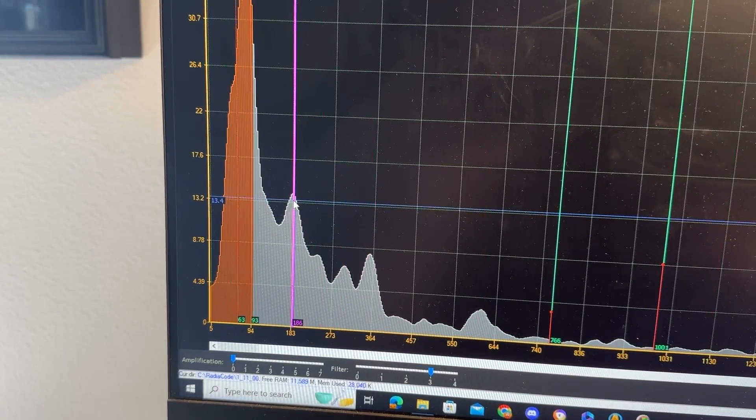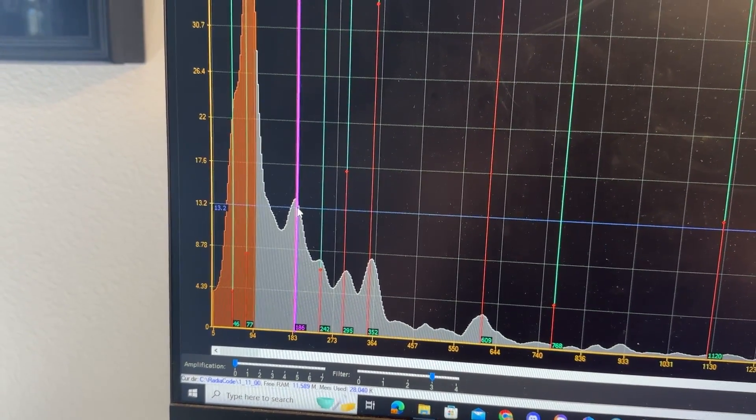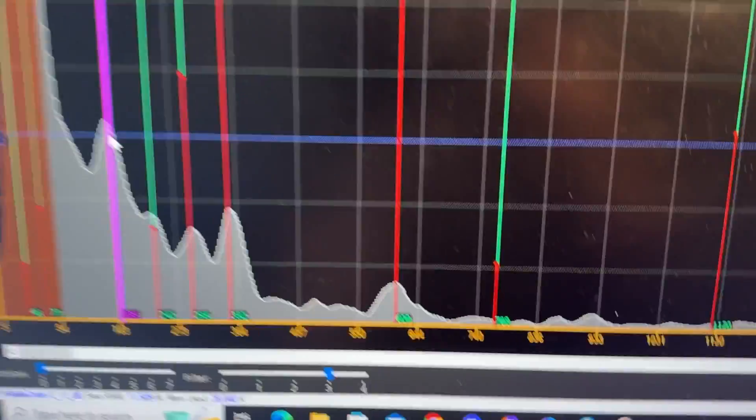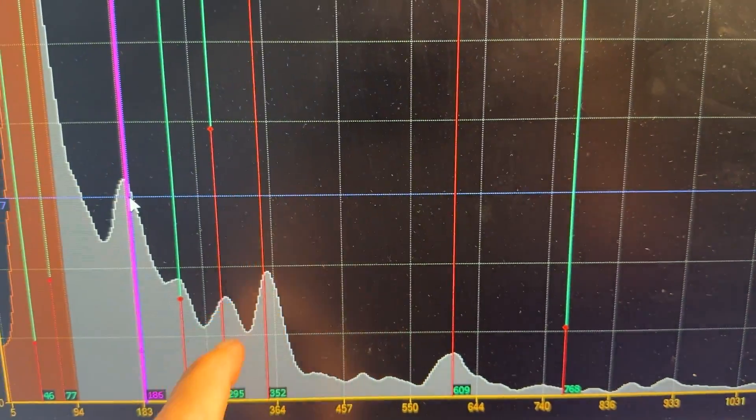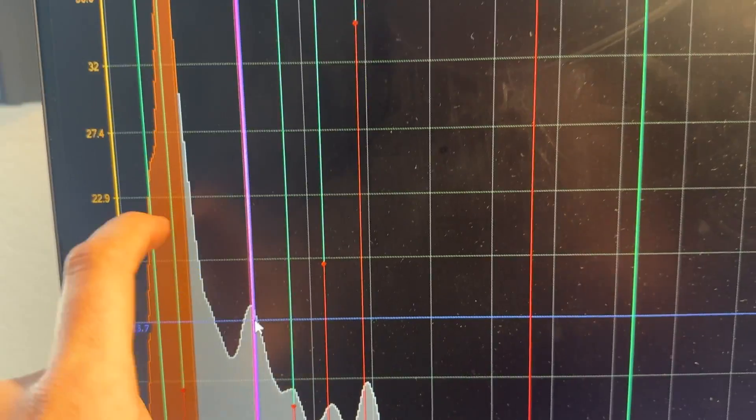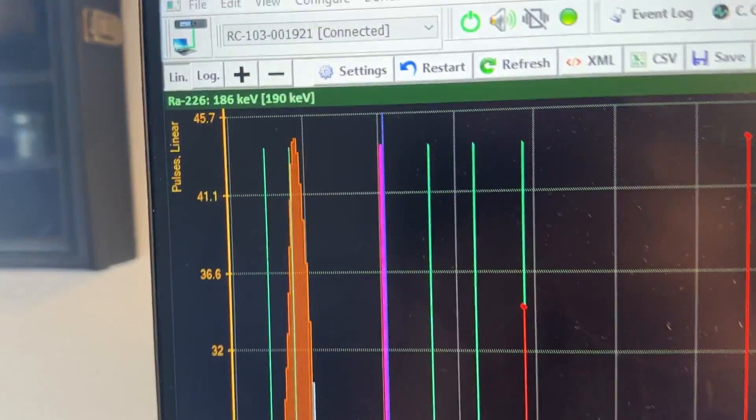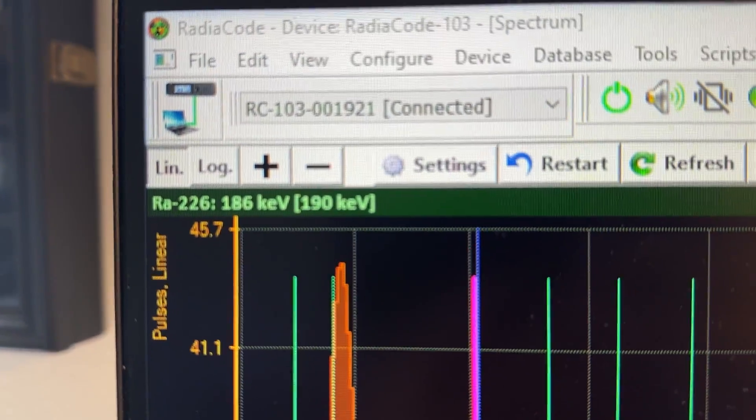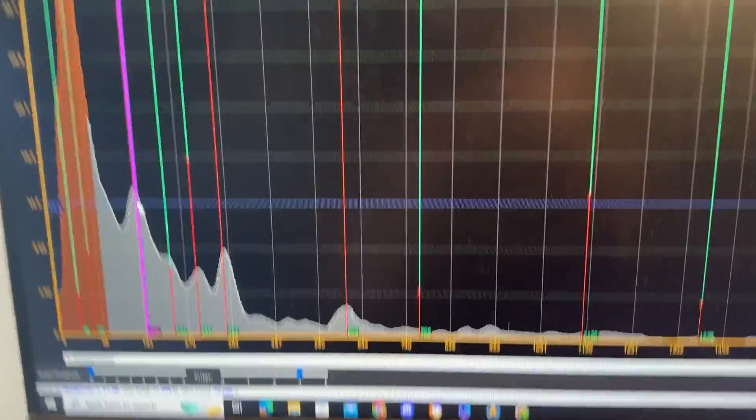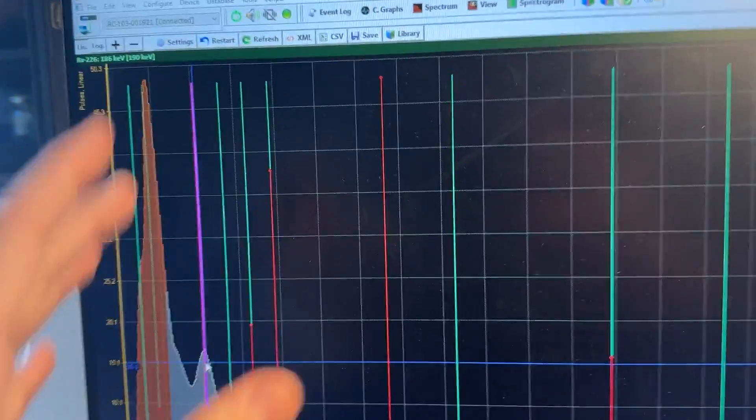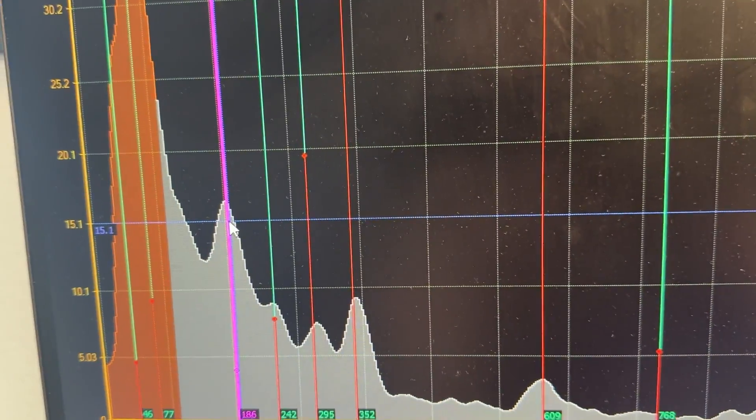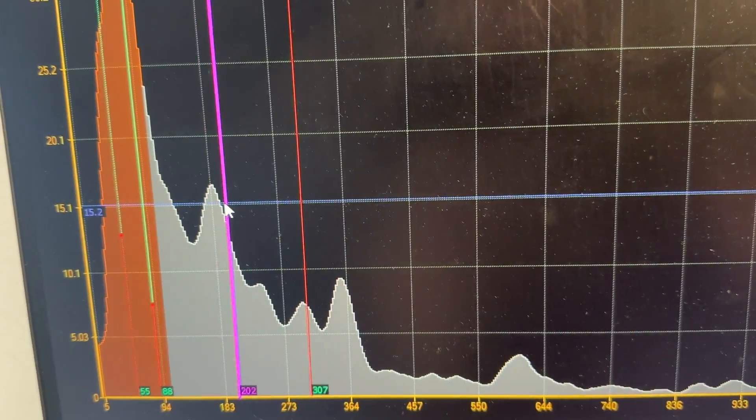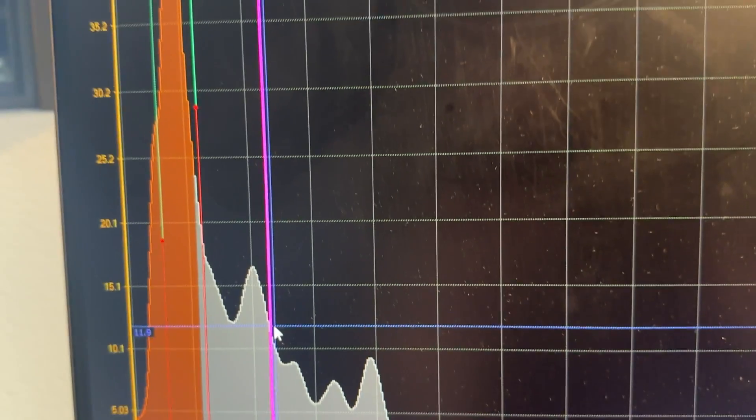We'll highlight say this peak right here. Okay and now we have highlights on all of these peaks. These lines are all matching up with the peaks that we see. And it is saying that that is radium 226. Which that is a radium clock. You can see the program has its own isotope library. And it kind of automatically gives you its best guess. And you just got to make sure that whatever you're on, all the lines line up.